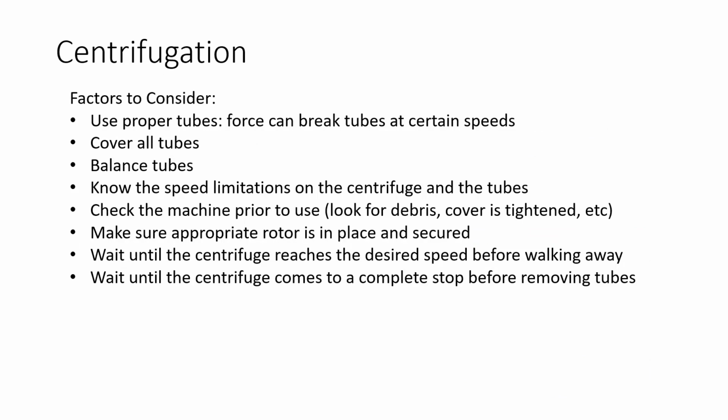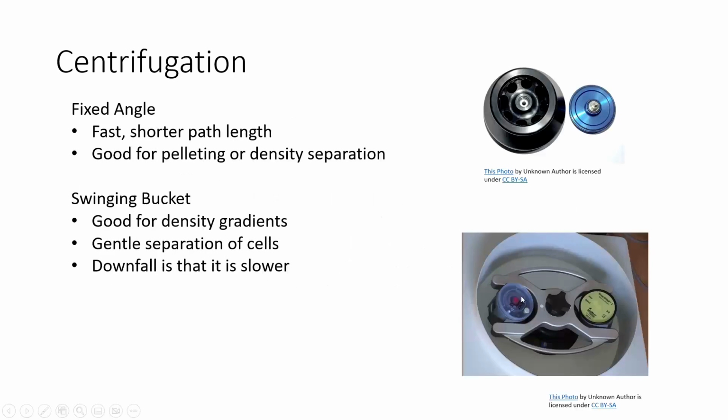Some factors to consider for centrifugation. Use proper tubes, because the force can break tubes at certain speeds, so make sure you're using tubes that can withstand the force of the centrifuge. Cover all tubes. You never want to put a tube in uncovered. Balance the tubes. When you're putting a specimen on one side, and I'll go back to the picture, a specimen of equal mass has to be on the other side, because that will balance it.